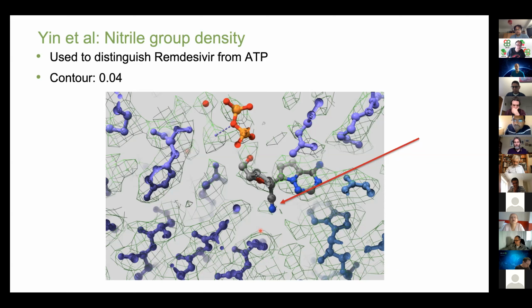It has been shown in other previous presentations that sometimes the fit suddenly pretends that we have beta layers. At a resolution of 3 angstrom we're supposed to see beta strands, but we don't see them, and suddenly the model goes just perpendicular to the lines in the map.